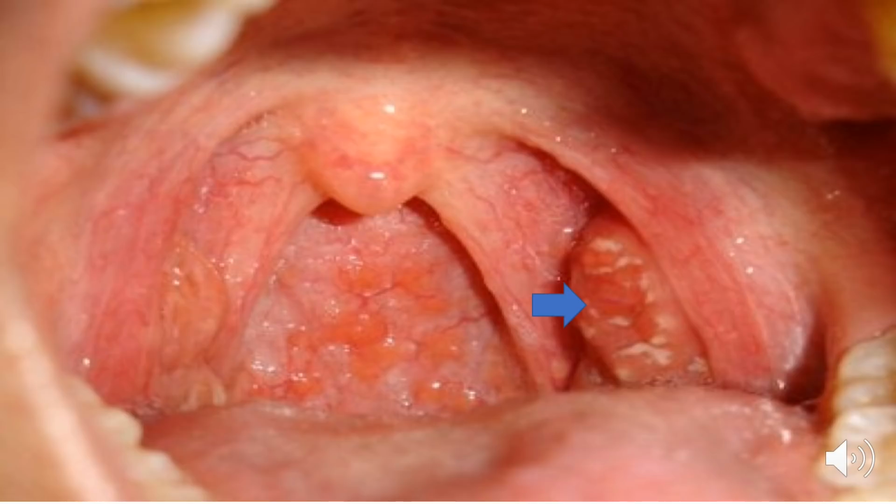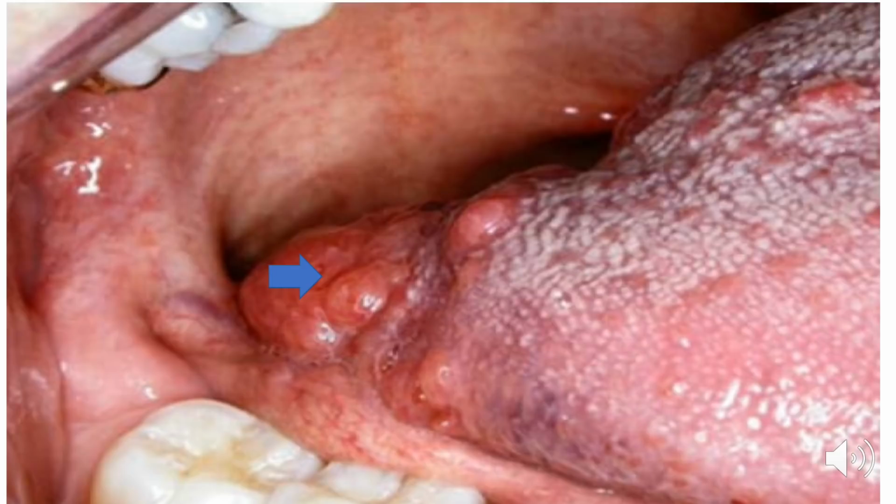This is the palatine tonsil. As you can see, this is supposed to be part of the digestive system, but you have there lymphatic tissues. So therefore, this is an example of MALT, mucosa-associated lymphatic tissue. This is the lingual tonsil, and the word lingual means tongue, and the tongue is part of the digestive system.